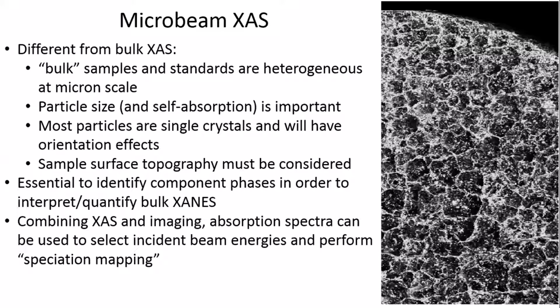Most particles are single crystals at this scale and will have orientation effects that must be considered. And sample surface topography, the relative orientation of the surface relative to the beam and the detector, must also be considered on this scale. So it's a different world, and you have to think about it that way. But it works very well once you have the right approach.